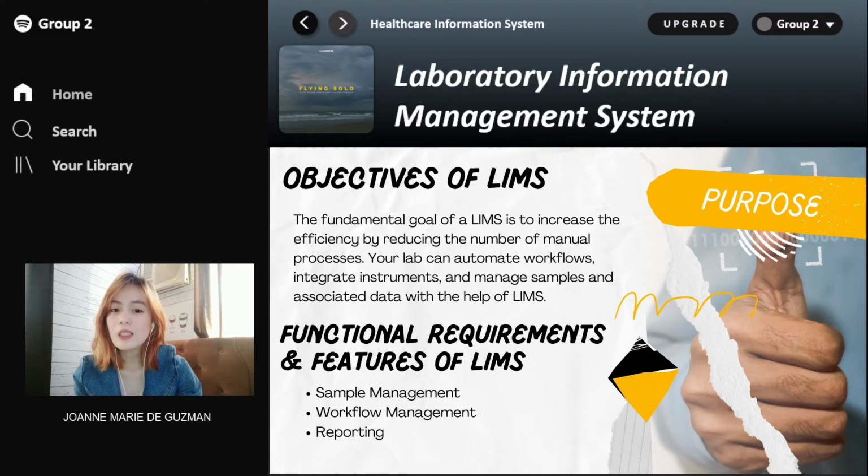Remember, utilize it to save time and automate records and workflows. Reporting. To make reports standard and personalized, they can be run and exported. Reports on the most frequently used instrument, the average sample handling time, and the list of backlogs are important in data analysis and the creation of future governmental recommendations.